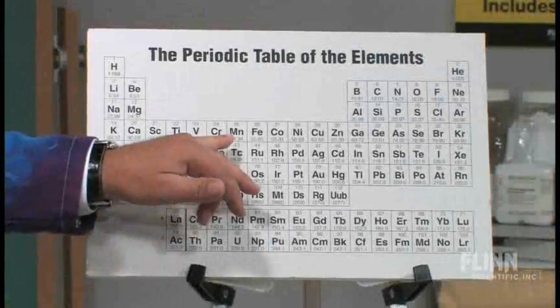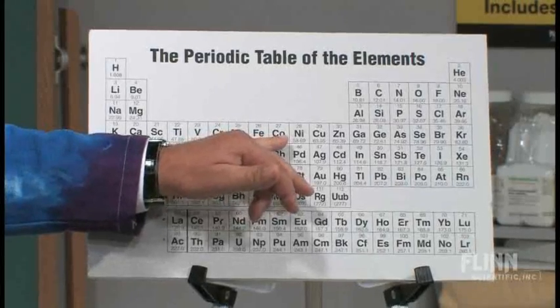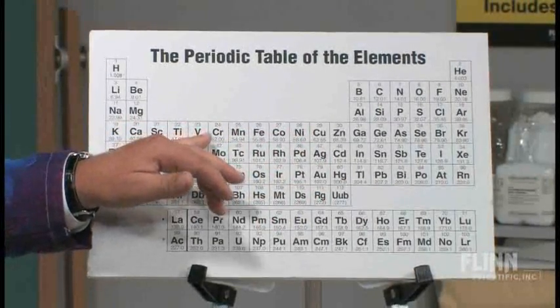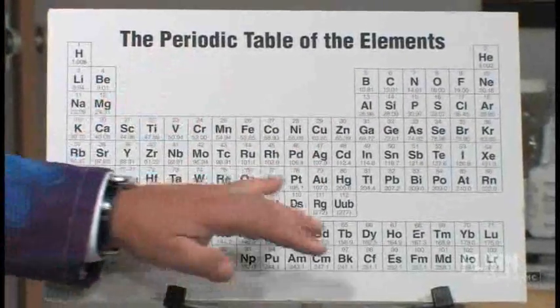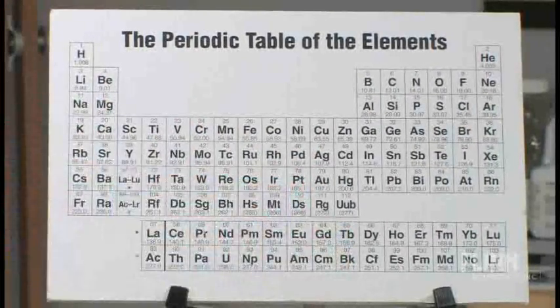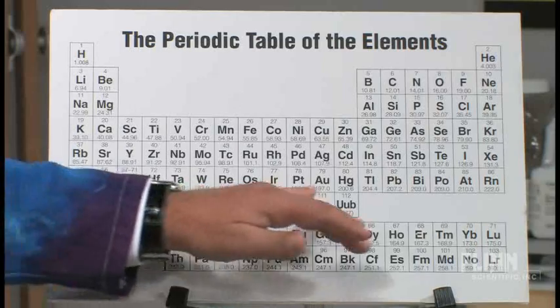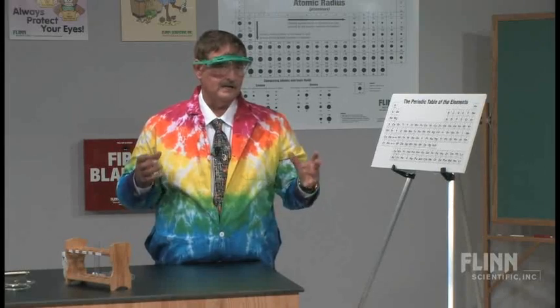So we have manganese, which I just made. We have some iron, we have some cobalt, we have some copper, and we have some chromium. So we have those 5 elements. We have lead, but the lead glass, if you remember the sample that I showed you, it was relatively clear. So lead, which is down over here, does not seem to have any colorant effect on the glass.